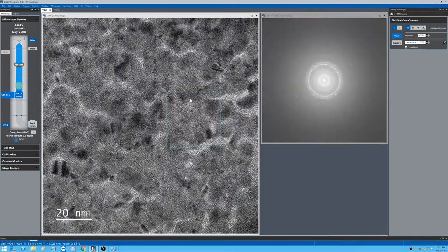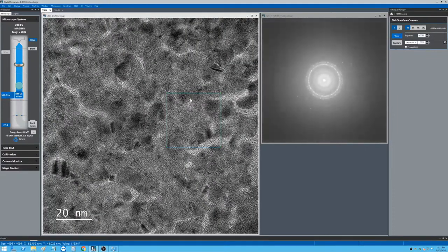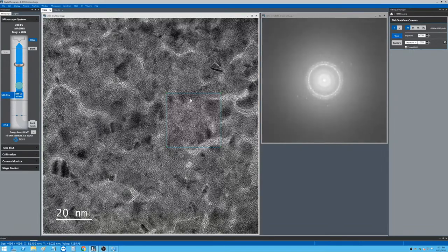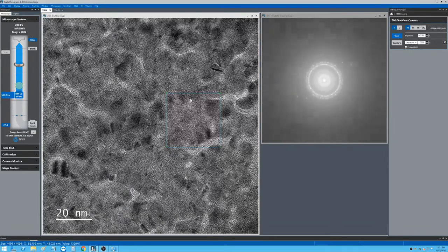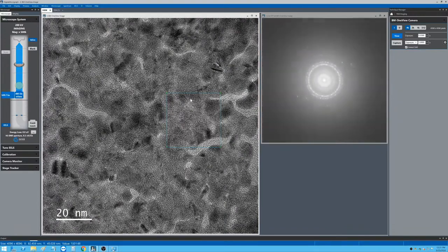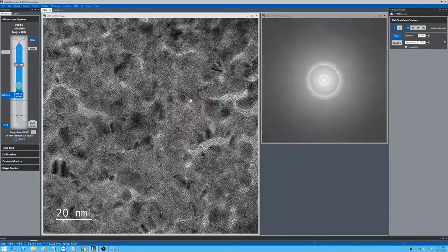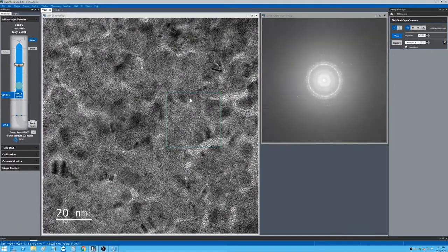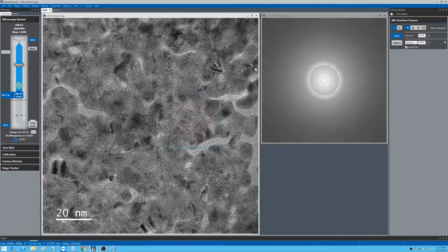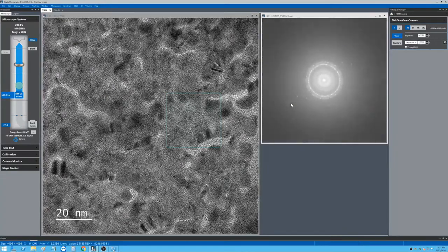So I'm going to pause here and see if anybody has a question about the things we just covered. If you have a question, please post in the chat area. And if you don't have questions, we will just go ahead and show the diffraction and the dark field imaging.